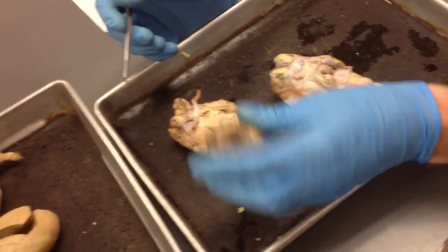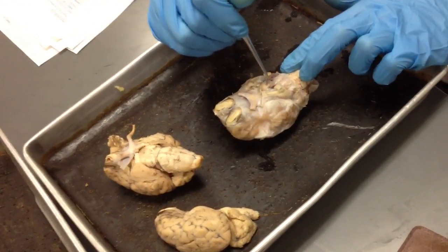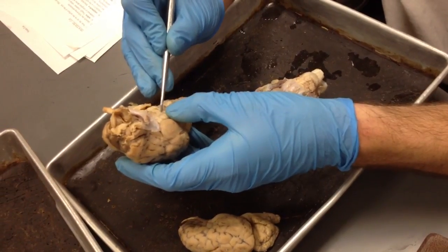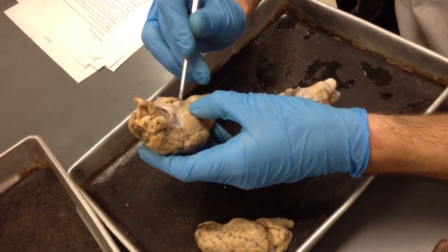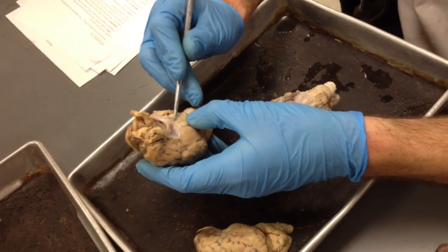The hypothalamus. The hypothalamus, to see that, you need to remove the pituitary gland. And the hypothalamus, or mammillary body, either name is accepted, is right here. This nice area, minus the circle hole in the center. It's right there. And that's the infundibulum. The infundibulum is the hole.